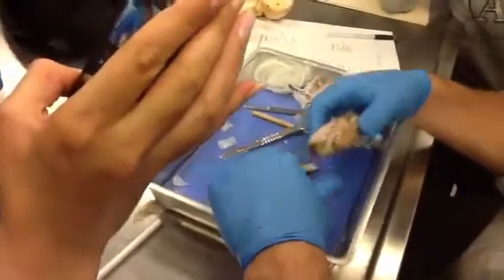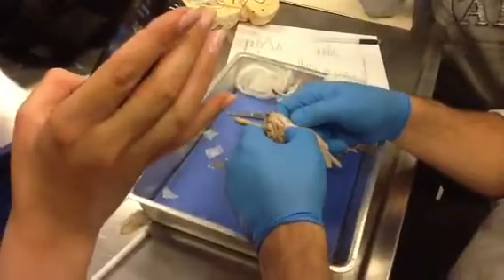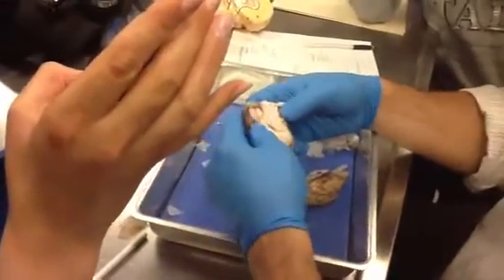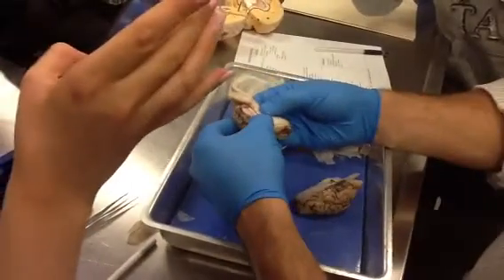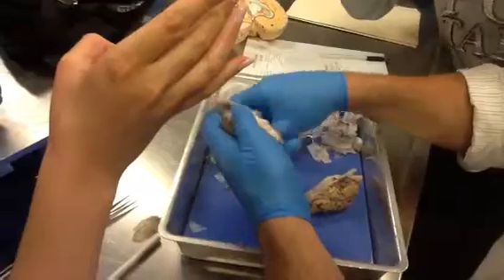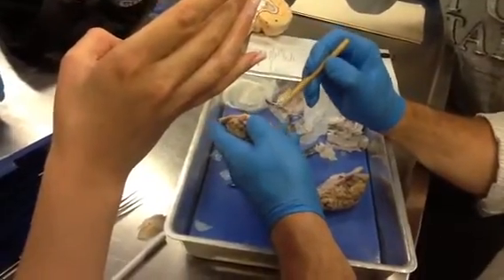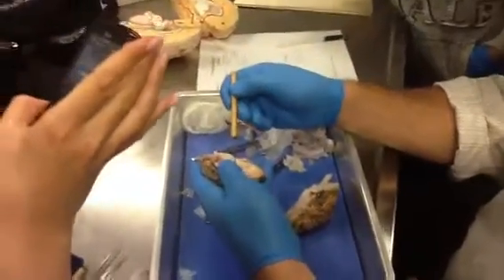And now you should be able to see something that looks like that corpus callosum, okay, that little Nike sign there. You should be able to see on both sides. And look what happens when I open this space. You see that space opening up in there? That's the lateral ventricle. Okay, it's going to be back in there. So if I say, what space am I poking into here? That's the lateral ventricle.